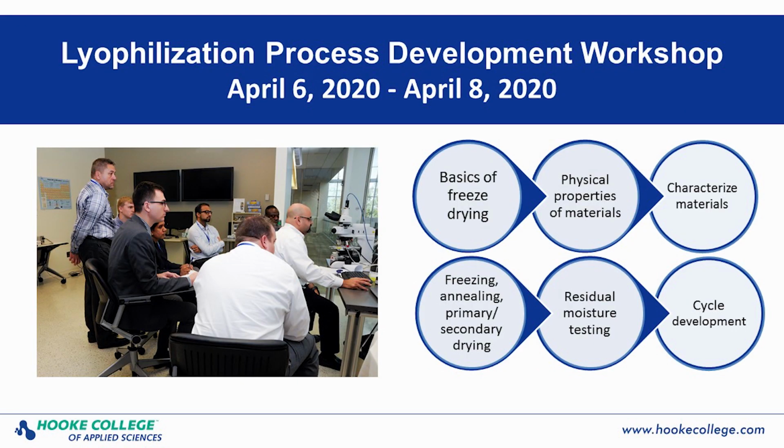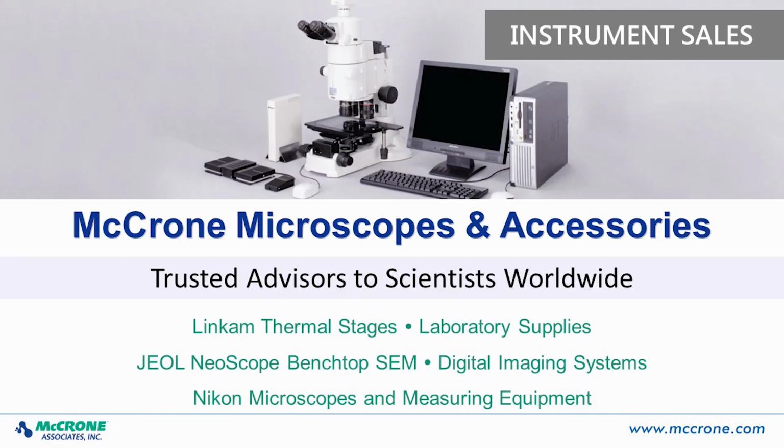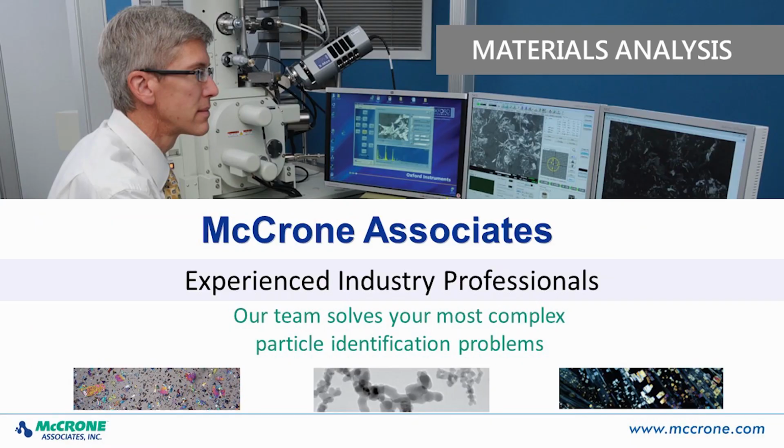Similarly, on the side of auto-dry, what auto-dry will tell you is essentially how high you can bring your shelf early on, the highest temperature that auto-dry reaches, and what a safe temperature to finish drying is. So we recommend two different ways of transferring an auto-dry cycle. A conservative method would be to set your shelf temperature for primary drying at whatever the final shelf temperature for auto-dry was. For our example, that would be -14, where instead of our conservative baseline temperature of -25, maybe we'll just take it straight up to -14 and hold it there for the cycle, because we know that'll be safe.